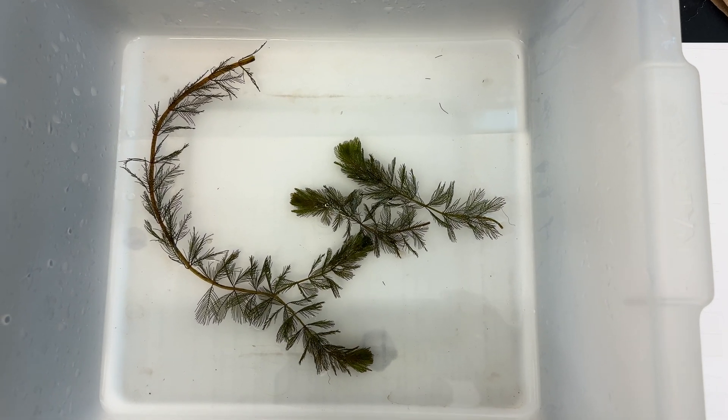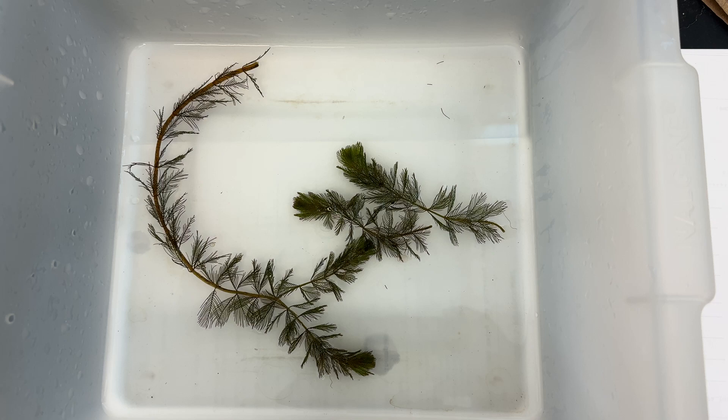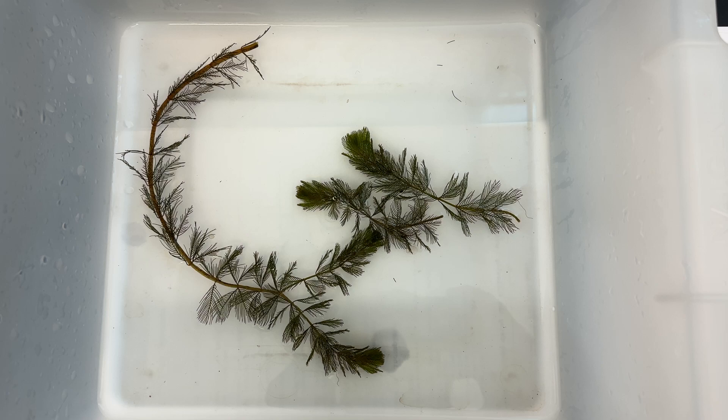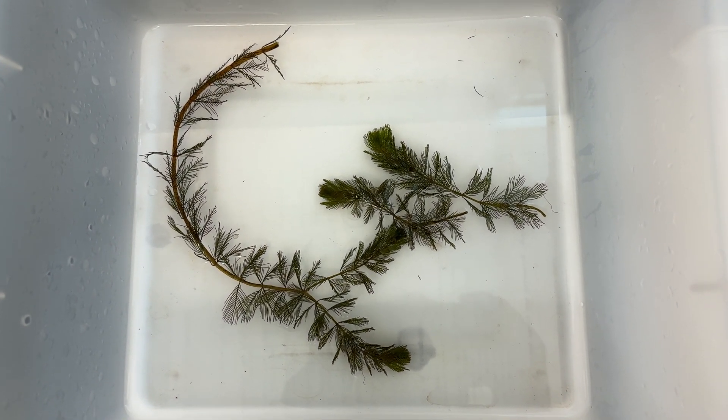For this video we're going to look at making a dried specimen in silica gel. I have a plant here that's been cleaned and it's in tap water right now, and I'm ready to transfer it over. I just want to start with the wet specimen and show you how we're going to dry it out.